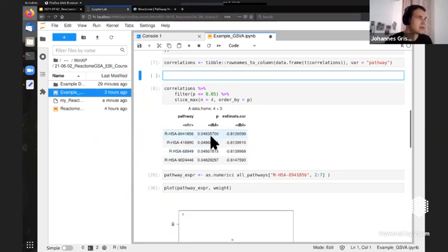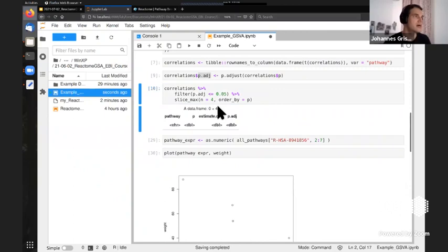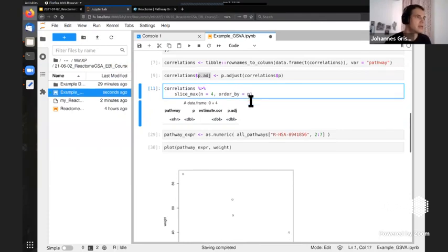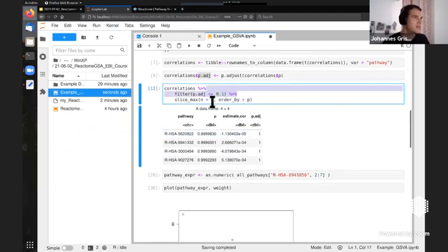So let's say to correlations, p.adjust, this is really great. Now we say, of course, our adjusted p-value, so we'll just copy this and put it here. Has to be smaller. Let's see. Oh, and we have nothing significant anymore. Bad example. Let's see where we have something. We don't know. So let's just take some random stuff. Okay. So, of course, this kind of failed miserably. Sorry about that. Just keep it at the p-value here for the sake of this tutorial.